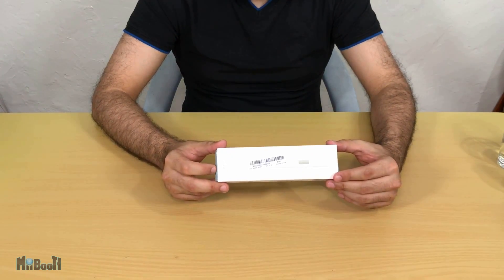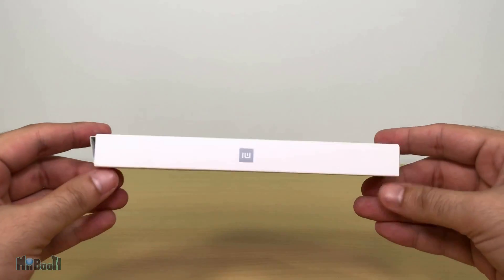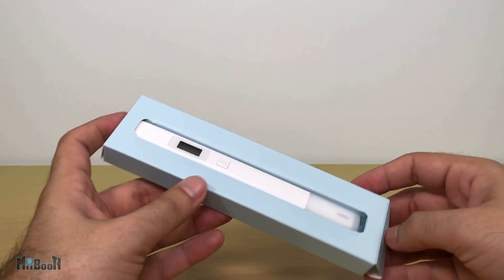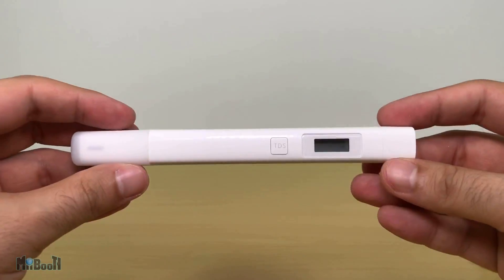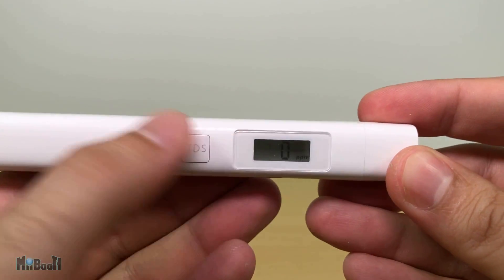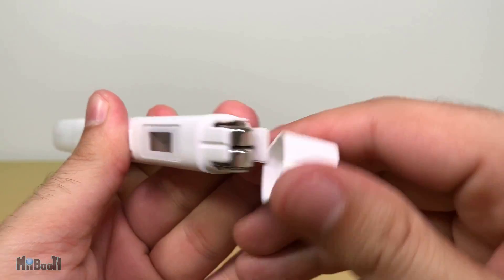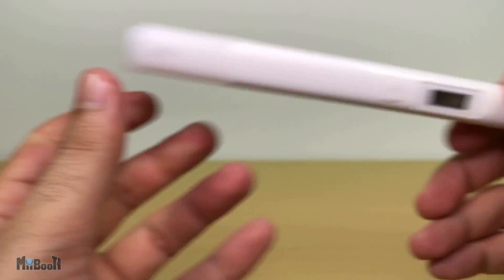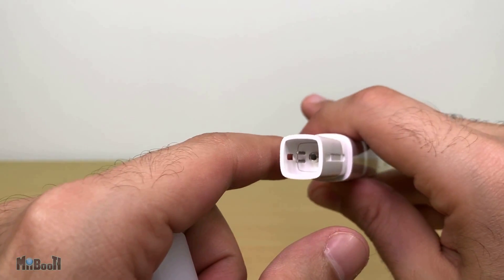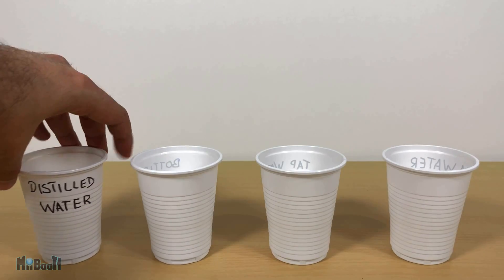Now that we know the basics, let's unbox the gadget. It comes in a really simple box, completely labeled in Chinese. Here is the device — it looks very much like a thick pen. There's a button that says TDS next to an 8-bit screen which displays numbers. On one end is the battery compartment with two small batteries, and on the other side is a cap below which are the two electric terminals — this is the side you dip in the water to test it.